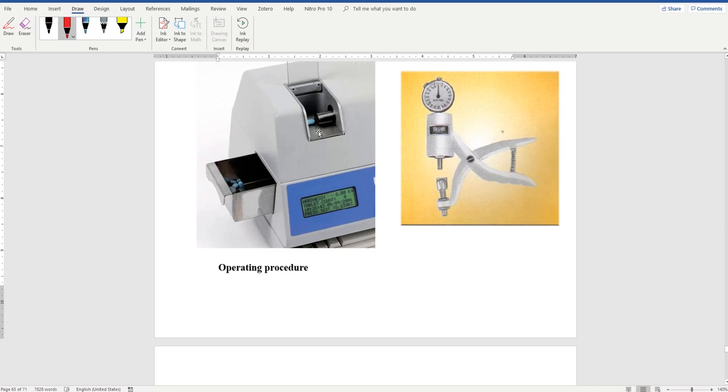Then register the resistance to crushing strength. Register 10 readings because you will be using 10 tablets, so for each tablet you have a reading. The pharmacopoeia does not say when it will pass or fail. It doesn't give you information about that. Who knows why it doesn't say what should be exactly the resistance to crushing? Think about it.